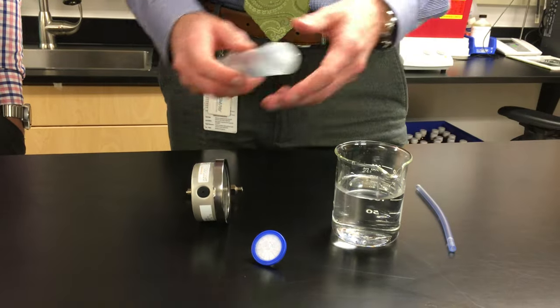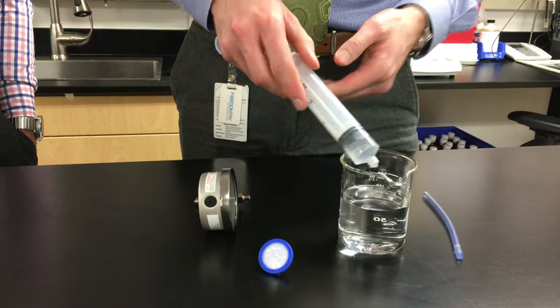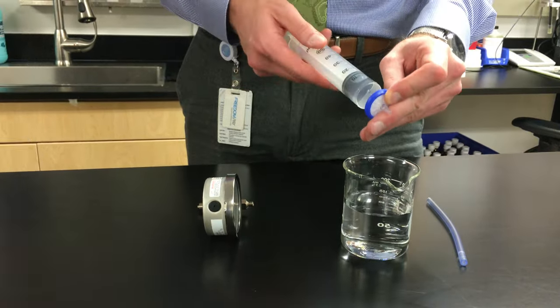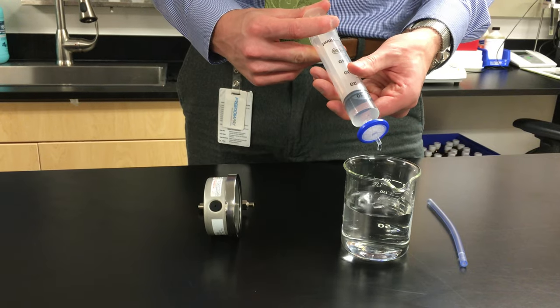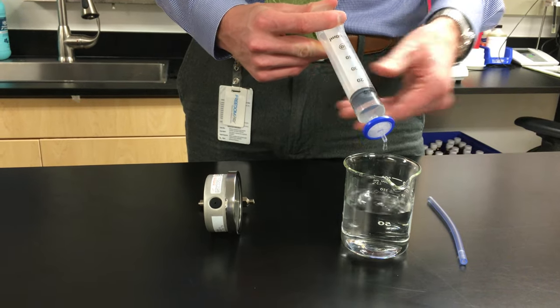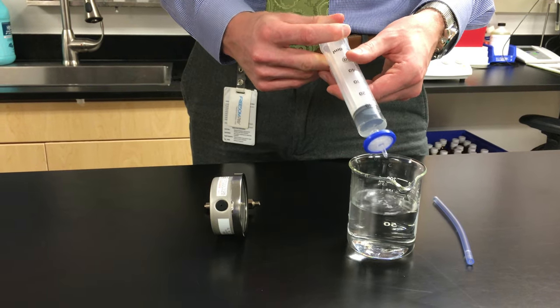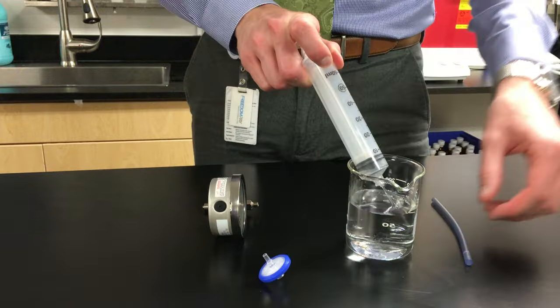The first step is to rinse the filter. We pass about 5 to 10 milliliters of water through the sterilization filter to rinse it out, because if it's dry, it will fail the test right away. Once it's been rinsed, set it aside.